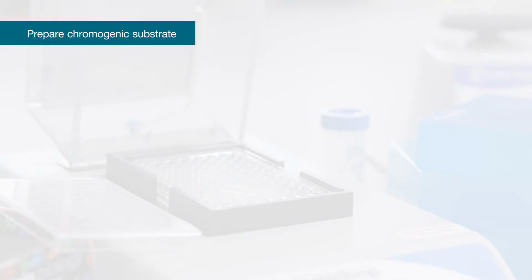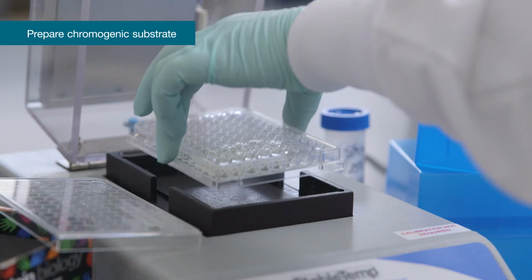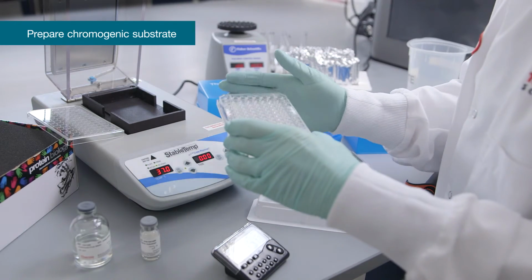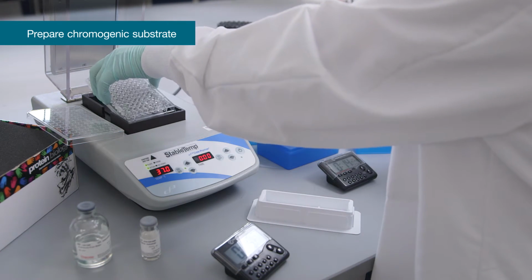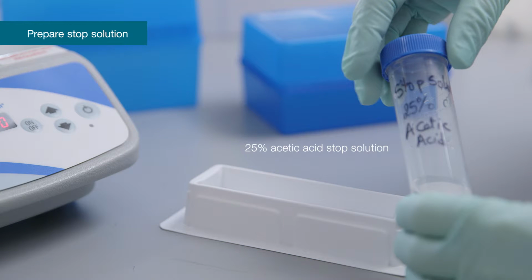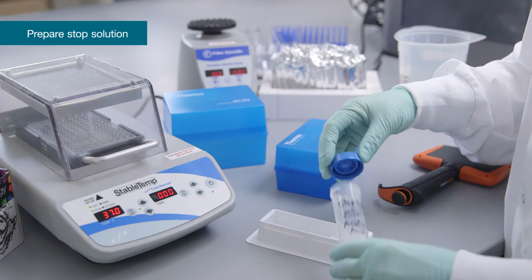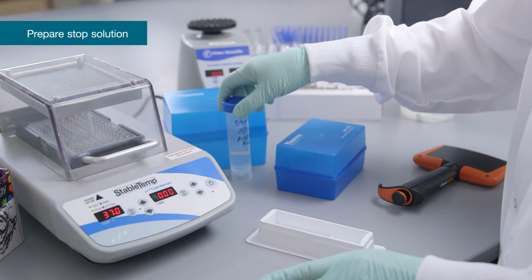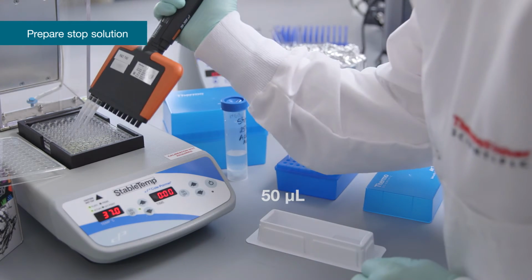After substrate is added to all wells, briefly remove the plate from the plate heater and gently tap 10 times to facilitate mixing. Return the plate to the plate heater at 37 degrees Celsius for the remaining incubation time. During the incubation time T2, prepare a 25% acetic acid stop solution. Add 50 microliters 25% acetic acid per well to stop the reaction.